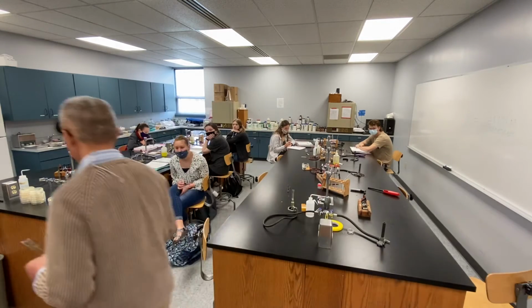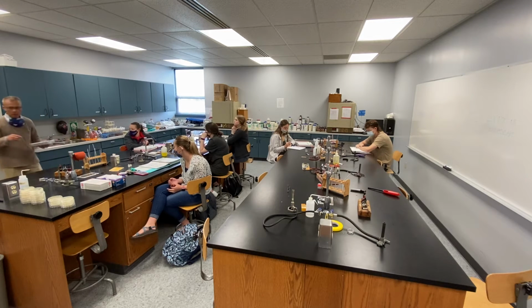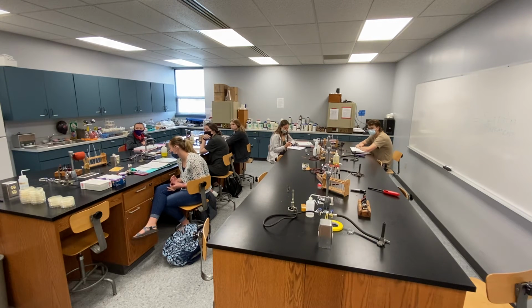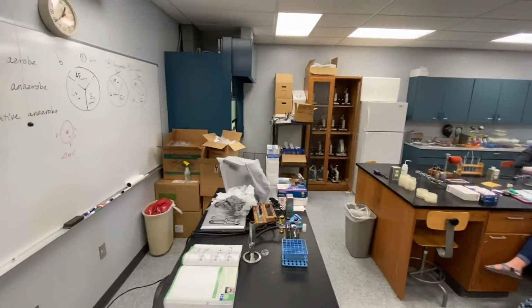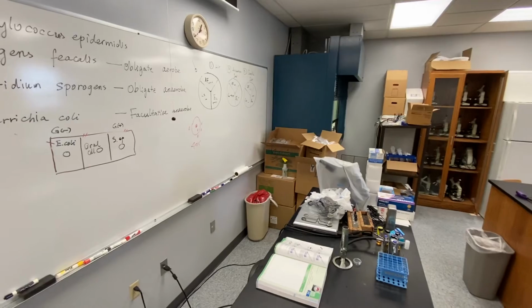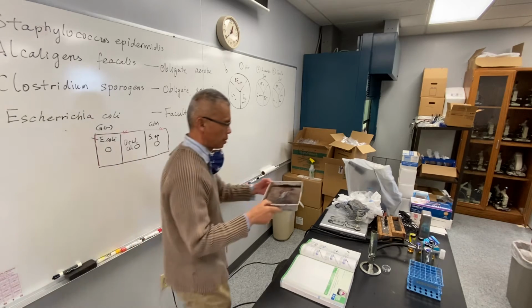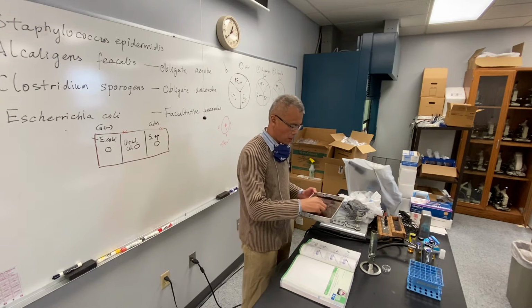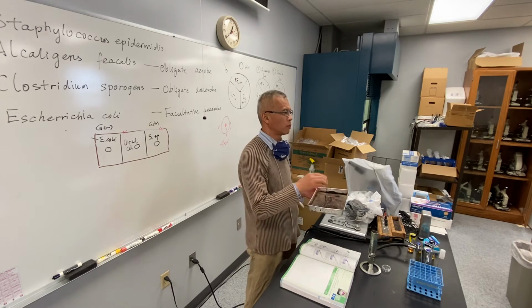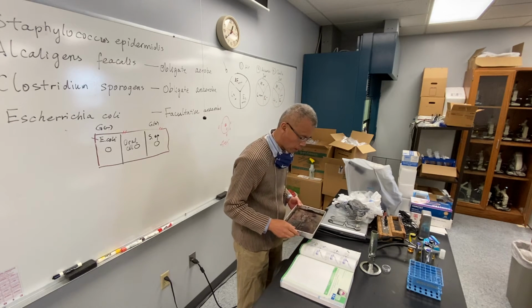Then use a tray. So I have a tray here. Yeah, use a tray, and place this on the tray like this. Go back, see everything here. Okay, on the tray, then you cover this with iodine. First, crystal violet 1 minute, iodine 1 minute, and wash out the iodine.